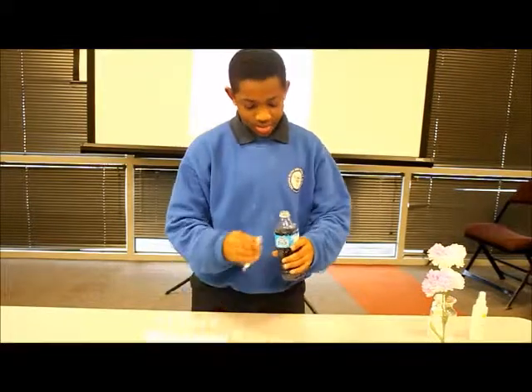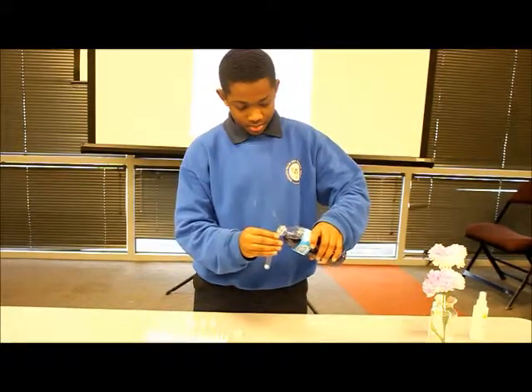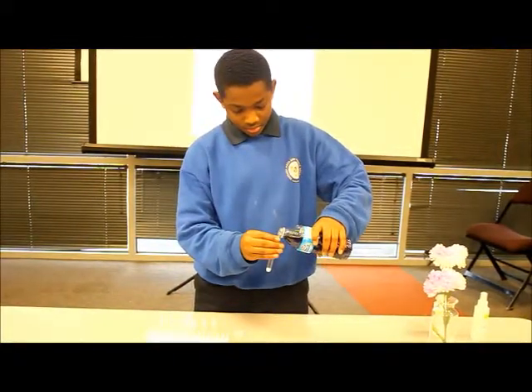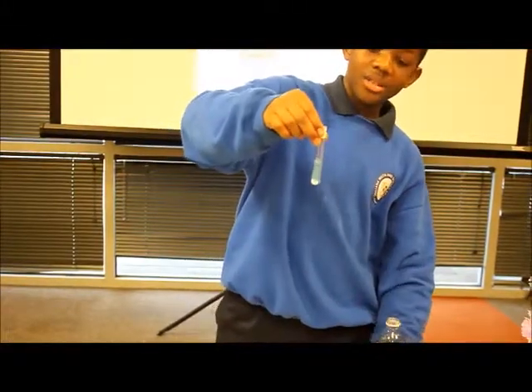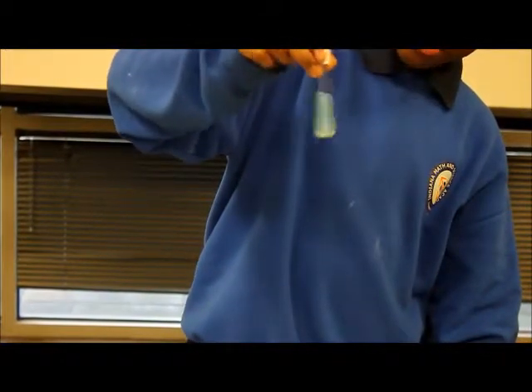First up, baking soda. As you can see, it just stays blue.